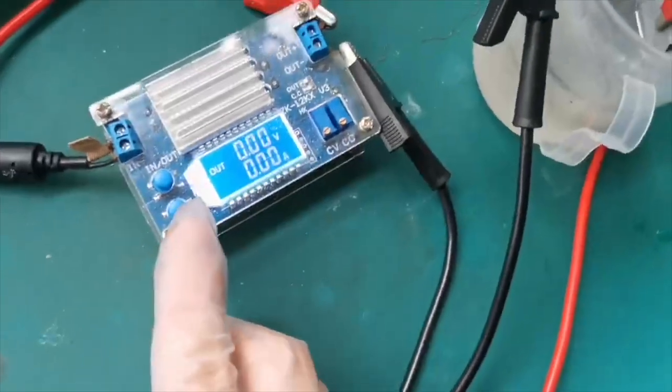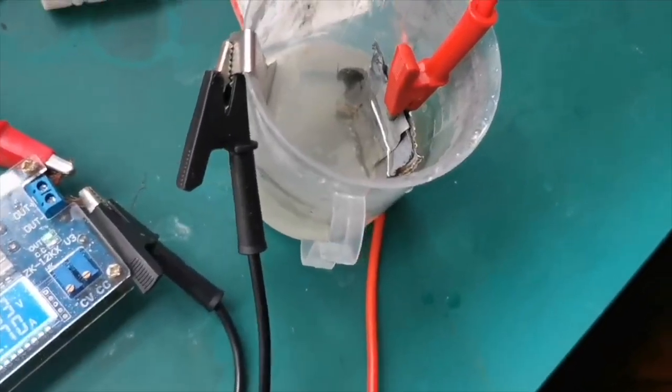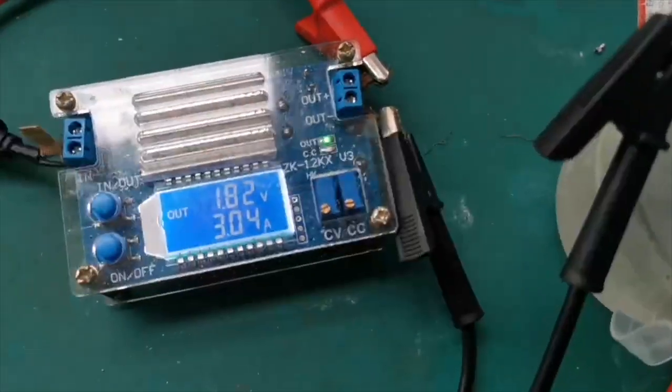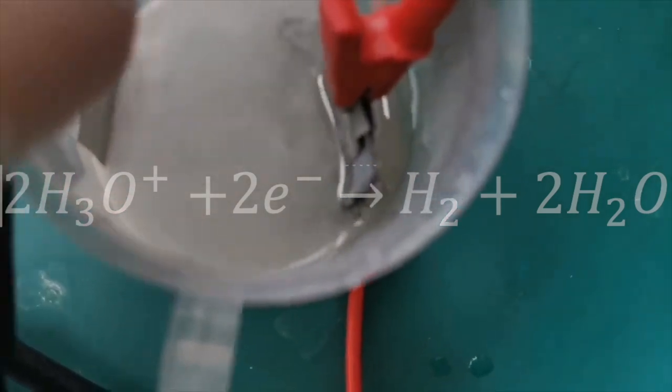And now we are ready to turn on the current. Three, two, one. There we go. The current was going around three amps and a lot of gases were forming at the cathode and this gas is just pure old hydrogen.